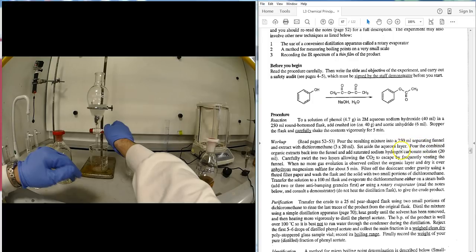The aqueous layer is set aside into a labelled beaker. The combined organic layers are then placed back into the separatory funnel for washing with sodium hydrogen carbonate. Two clear layers are visible — top aqueous layer and bottom DCM layer.